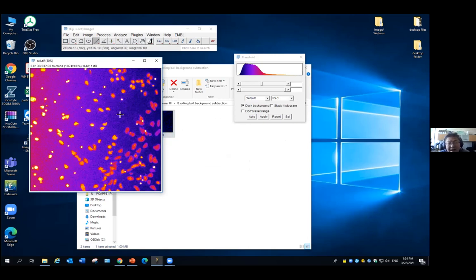So when this happens, if you want to solve this problem, you always have to go back to the microscope and realign it. That's basically the only way you can do it. You know you have a problem on your microscope, and that shows very clearly on this image. If you want this project to keep going, you have to solve this problem.